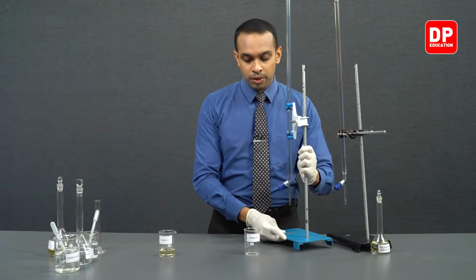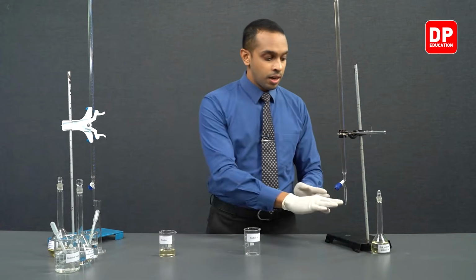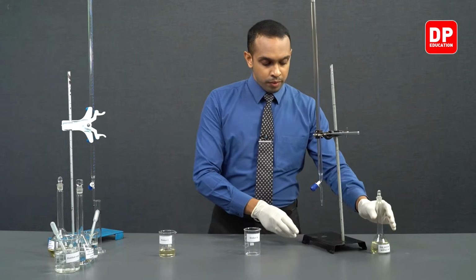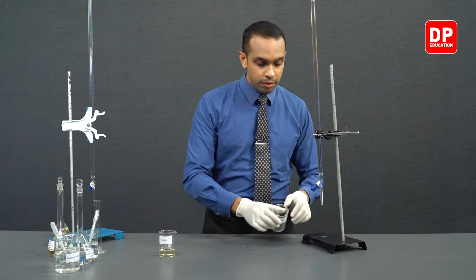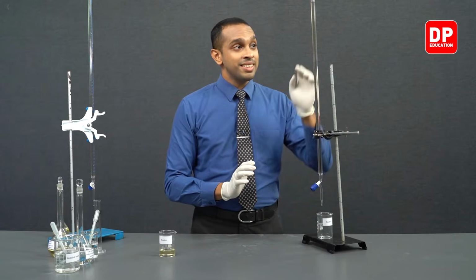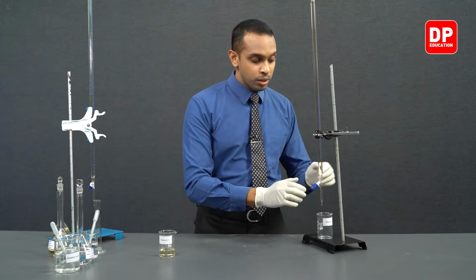So the next burette that we have over here contains our potassium iodide solution. It's filled all the way to the top. So if you take a look at our potassium iodide solution here, and if you take a look at your practical or lab manual, you would observe you need to take 10 cubic centimeters of potassium iodide solution into beaker 2.